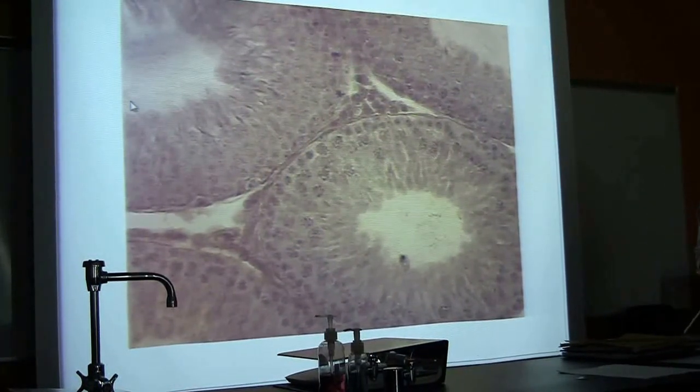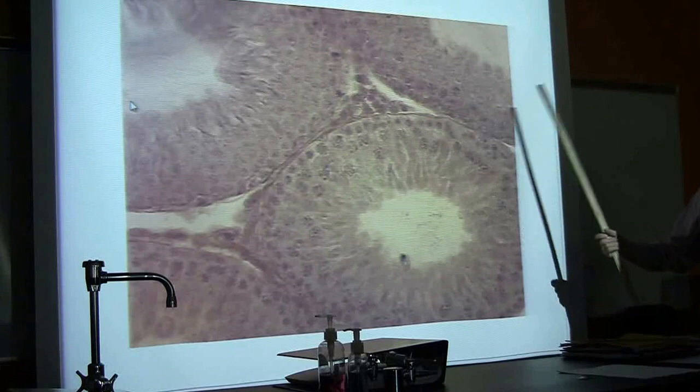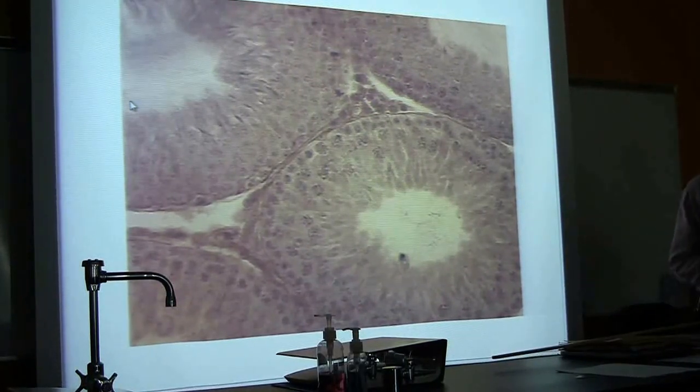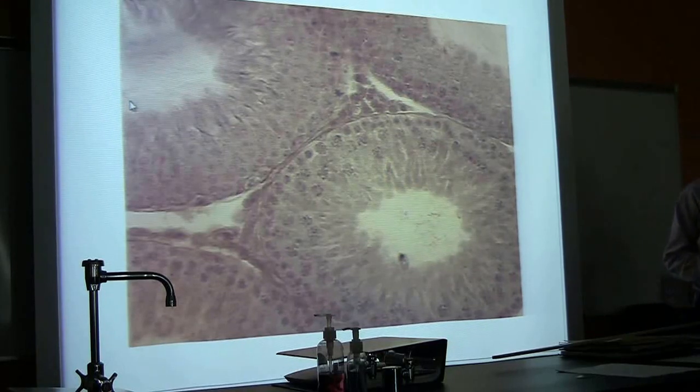I want you to know the cells involved. On the slides, I'm not going to ask you about the individual cells involved in spermatogenesis. However, on the models, these bubble charts, I will. I expect you to pick them out.